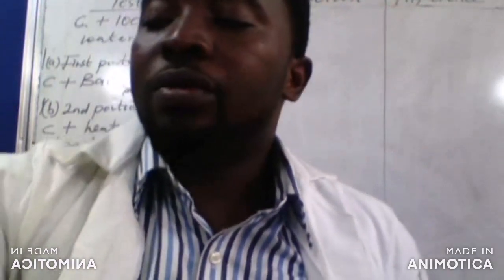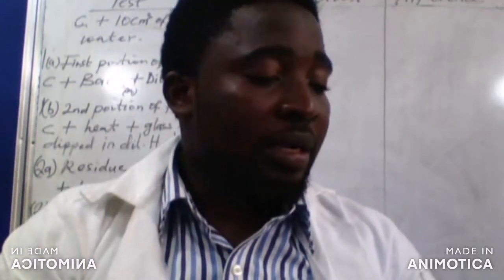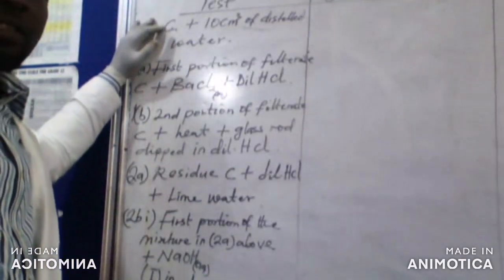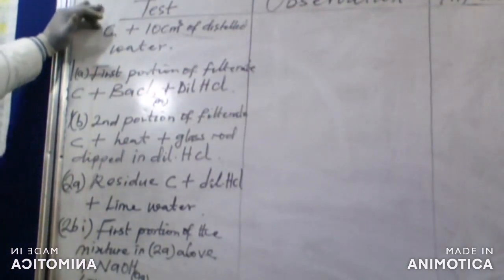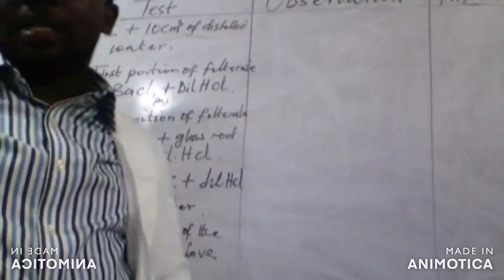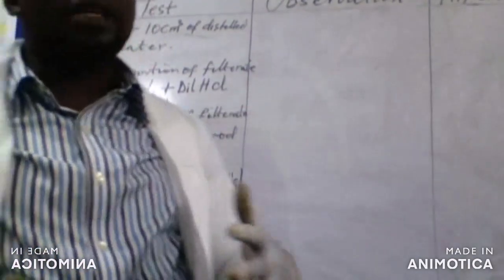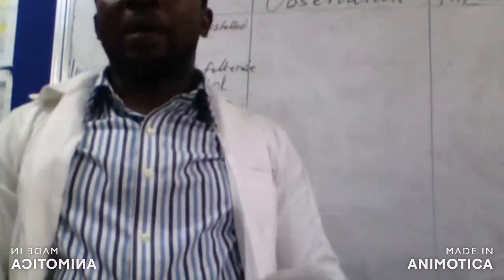Without wasting much of your time, let us go to the observation table and carry out the instructions given. The first instruction says we should dissolve C in 10 cm³ of distilled water. Before I dissolve C, I need to produce that salt mixture, which is gotten by adding ammonium carbonate and copper sulfate.